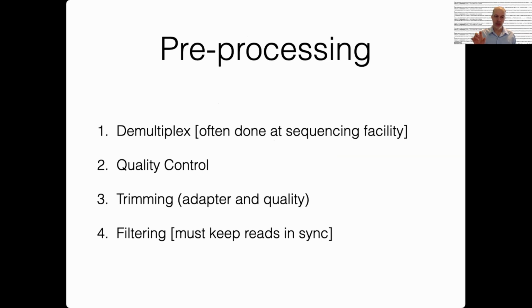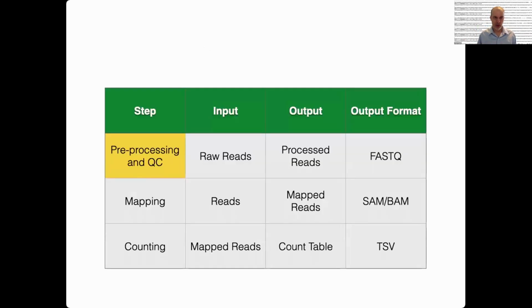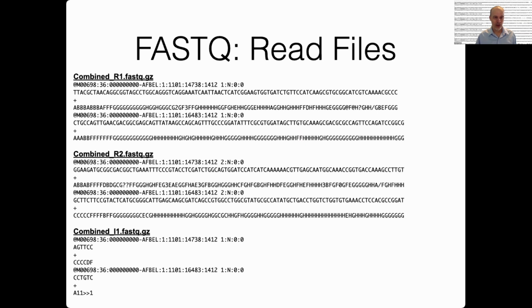One reason you might trim a read is based on the quality score, which we just looked at. You can look at the quality scores here, and even without knowing exactly the mapping between quality and these characters, you can tell that it's not consistent across the read. We see a bunch of H's here.